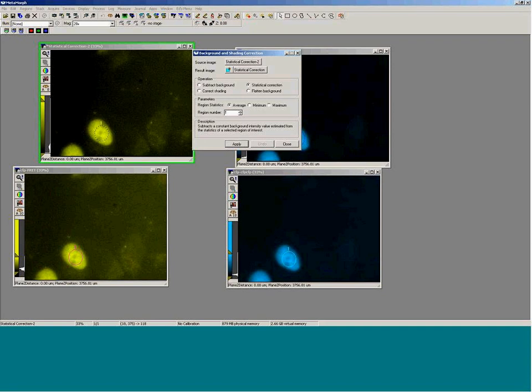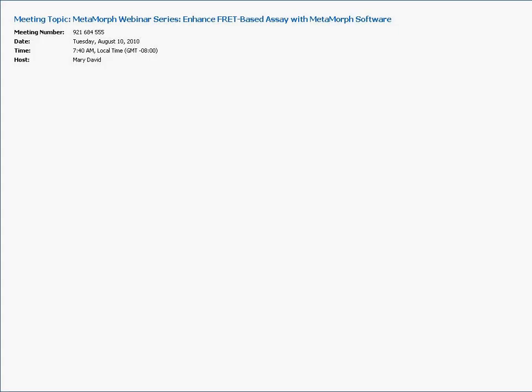So hopefully everybody can see that by doing the arithmetic, the corrected FRET divided by, in this case, just the acceptor to generate the FRET efficiency, but I have to do the multiplication by 1,000 to generate these numbers, and then it's just a matter of moving the decimal place over, so I have one decimal point percent ranges for that. So we can see we're falling within what the expected efficiency rating should be within a typical FRET experiment, somewhere around 30 is a good expression.